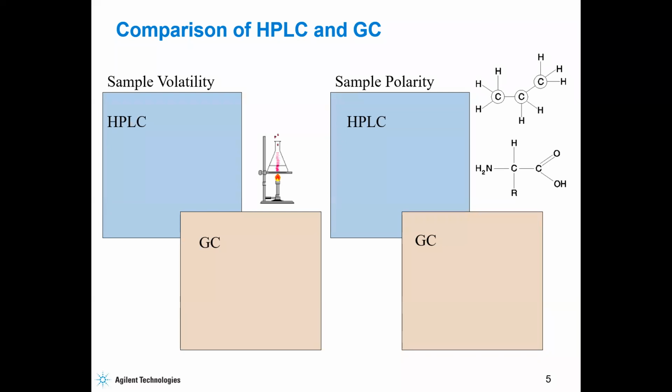Remember that it's the interaction that brings about separation. So if they have different interactions, they will have different separations. I hope I've answered your question. Yes, ma'am. Thank you. Okay, so now let's also quickly revise the comparison between HPLC and GC.